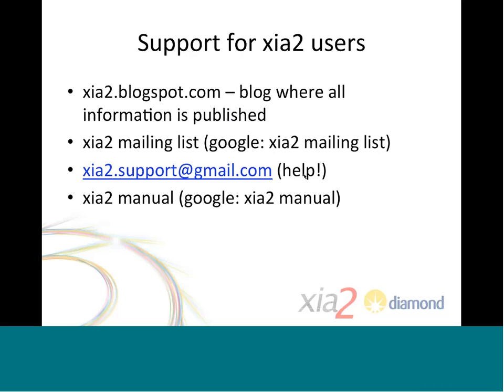Okay, that would have been an excellent thing for me to cover. Essentially, by default, XIA2 will pick a resolution limit where your merged I/sigma is about 2, and the unmerged I/sigma is at least 1. It picks the lower of those two limits because if you have, like, 90-fold redundancy data, then it often happens that exceedingly weak data, when you merge all of those, gives you unreliable statistics. That's where the unmerged I/sigma comes from. The merged I/sigma is just generally considered to be fairly reasonable.